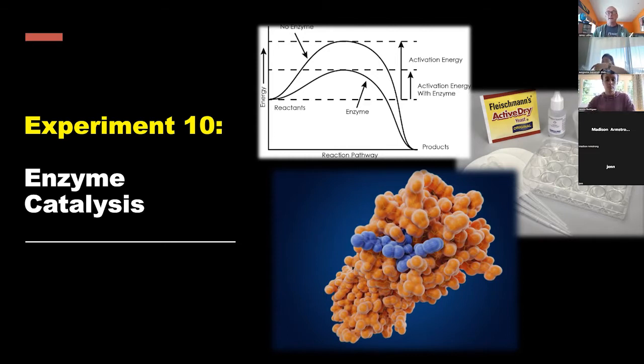But we're going to learn a little bit about the reactions they catalyze and the effects of the concentration of the enzyme and the pH involved. The pH is extremely important when we're dealing with enzymes and their activity, as well as the temperature. So let's have a look.